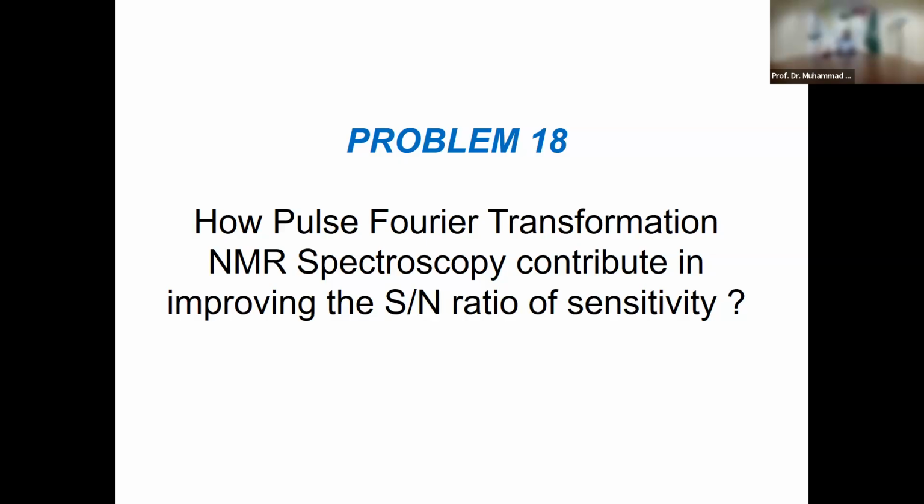After some time, you do exactly the same thing, because by that time it has relaxed back to thermal equilibrium, and so you can repeat this experiment literally hundreds of times. And as you repeat this experiment hundreds of times, you get lots of FIDs, you convert them into frequency domain, and you get better signal to noise ratio, which is also called sensitivity.